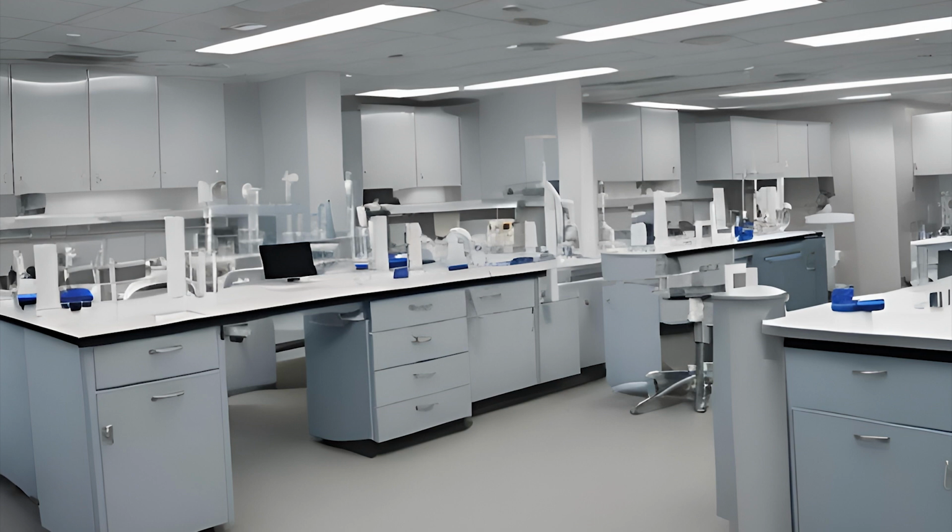An aliquot is the term for taking a portion of a specimen out of your main sample tube and transferring it into another separate container that you're going to use to transport around the lab to run your testing on. Your aliquot may be into a separate tube that you then seal and label, or it may be into a small cuvette or container designed to fit just neatly into a rack on a machine.